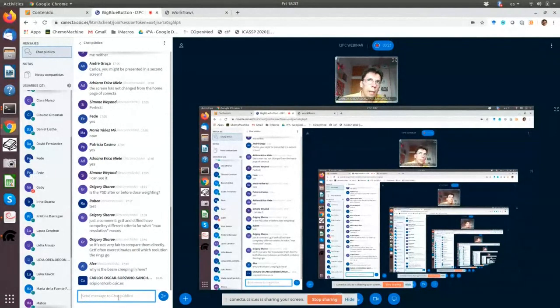That line is clearly incorrect, but that doesn't mean that the protocol should fail. So just skip that line. Depending on the error, we can try to ignore it or fix it. We make some assumption that is not fulfilled by the import. In this case, the protocol failed, so I couldn't go further.